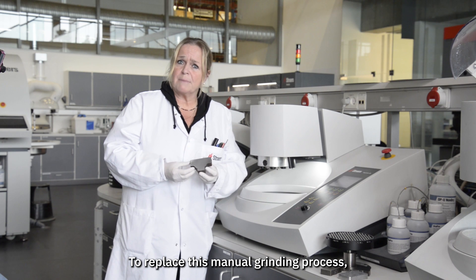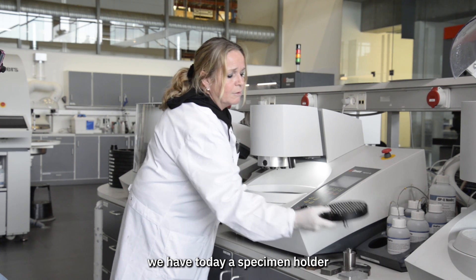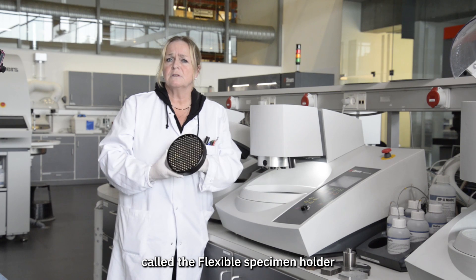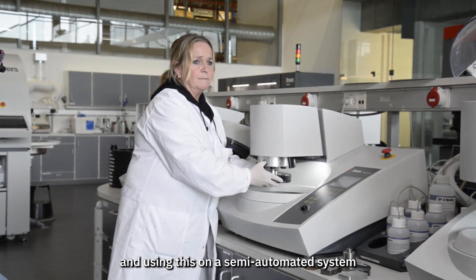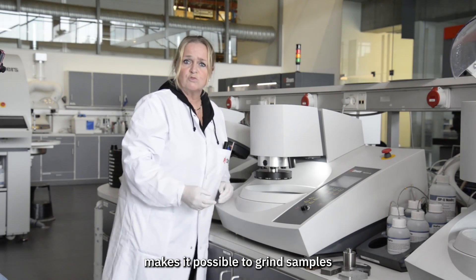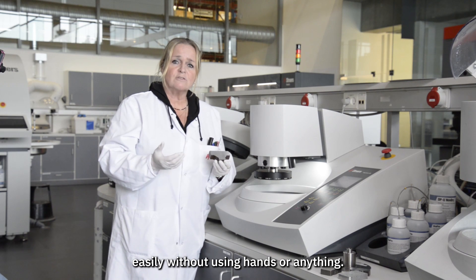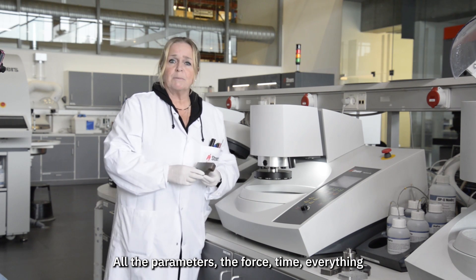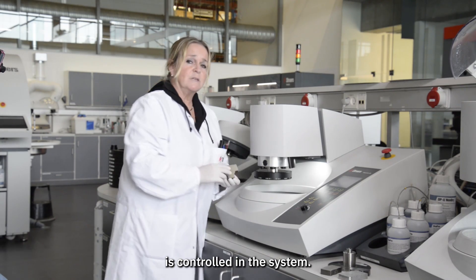To replace this manual grinding process, we have today a holder called the flexible specimen holder. Using this on a semi-automatic system makes it possible to grind samples easily without using hands. All the parameters — the force, time, everything — are controlled in the system.